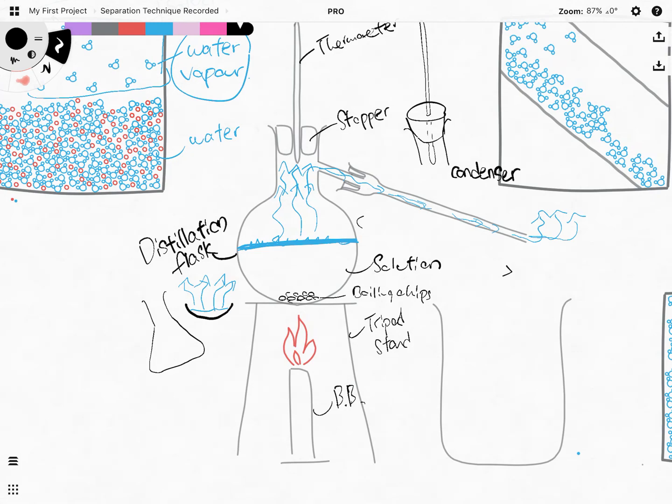So in reality, I did not show you one final apparatus. This glass tube is surrounded by, in a sense, a bigger glass tube. So imagine like a small glass tube in a bigger glass tube, right? And then I'm going to fill up this bigger glass tube with cold water.